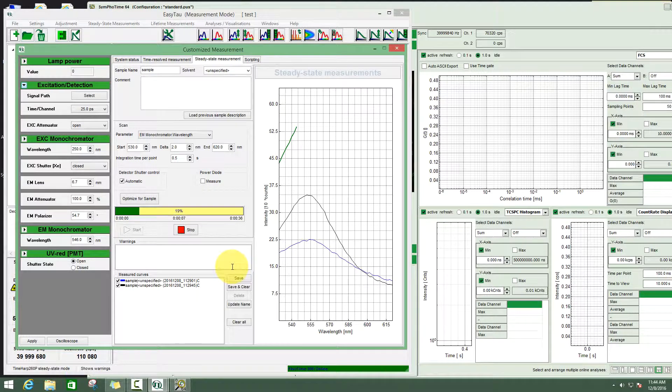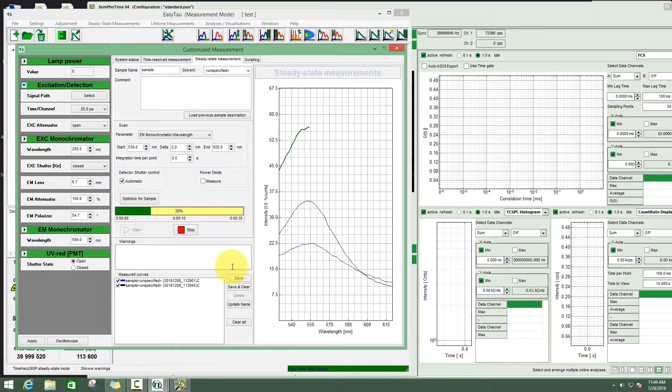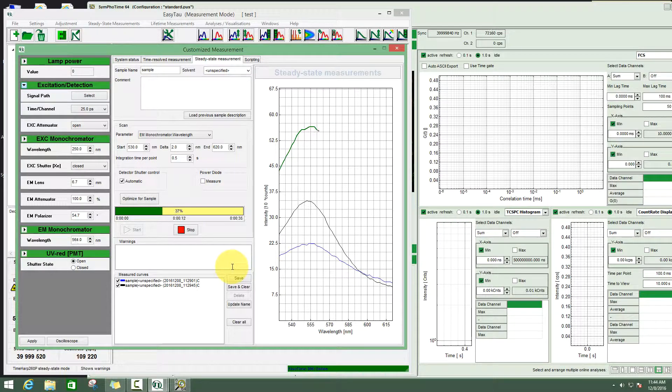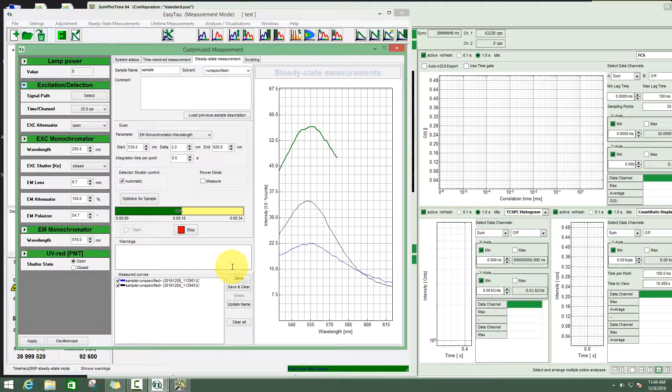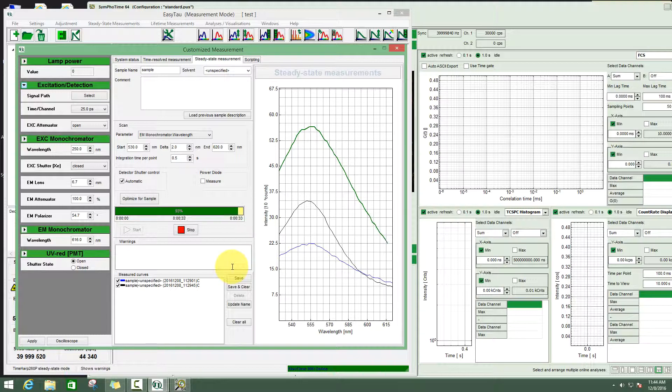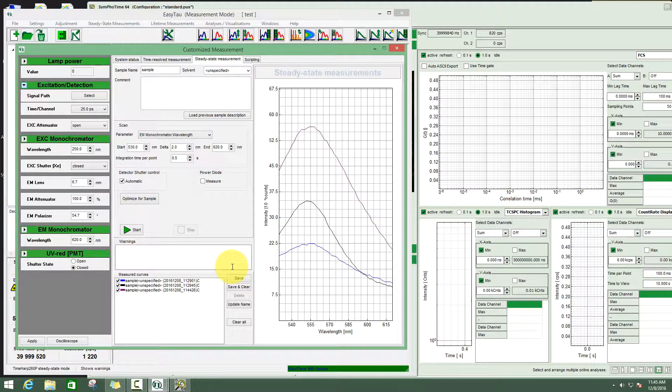Depending on what you want to do, you can use either the EasyTau or the SymfoTime functionality. The analysis of the data depends on which software you used for the recording. You can use the functionality of these software packages. The explanation of the analysis is continued in the tutorials that you can find on the PicoQuant web page.